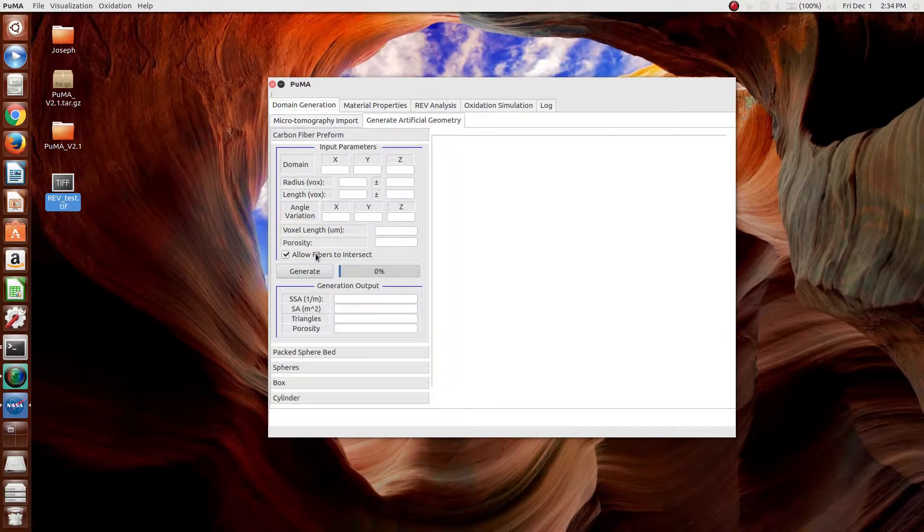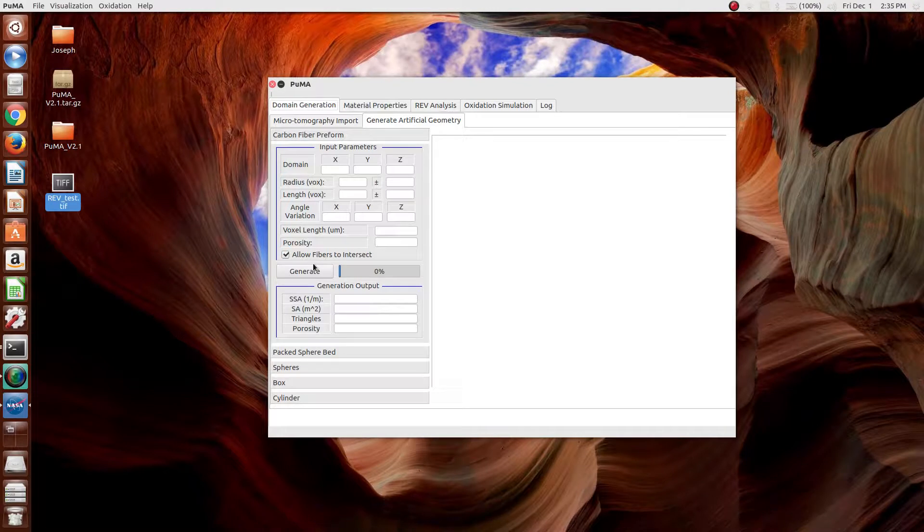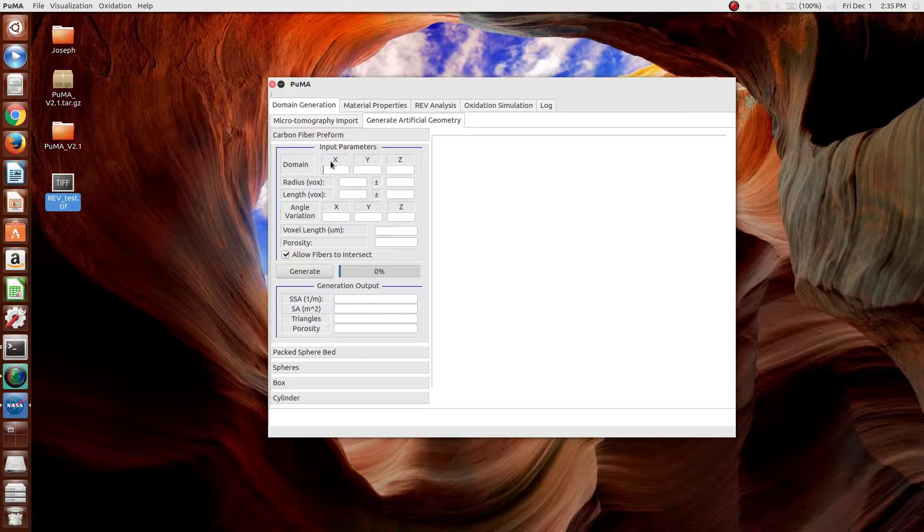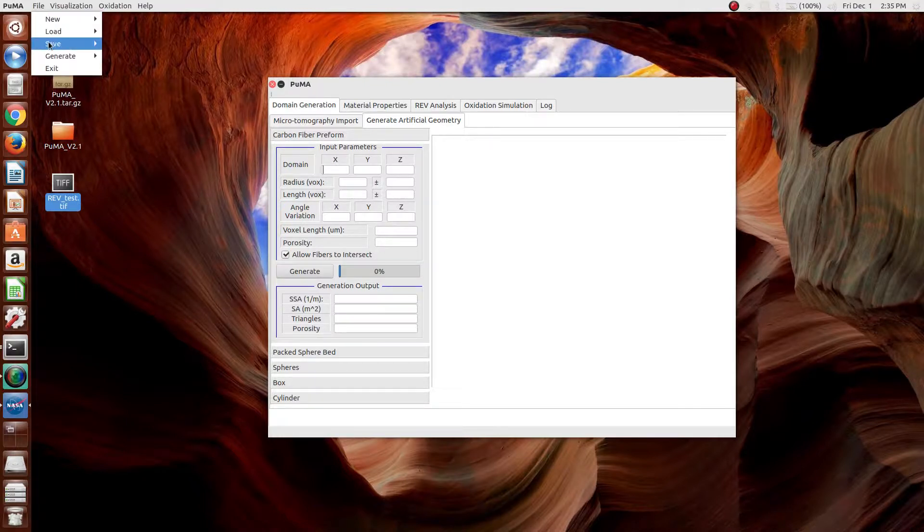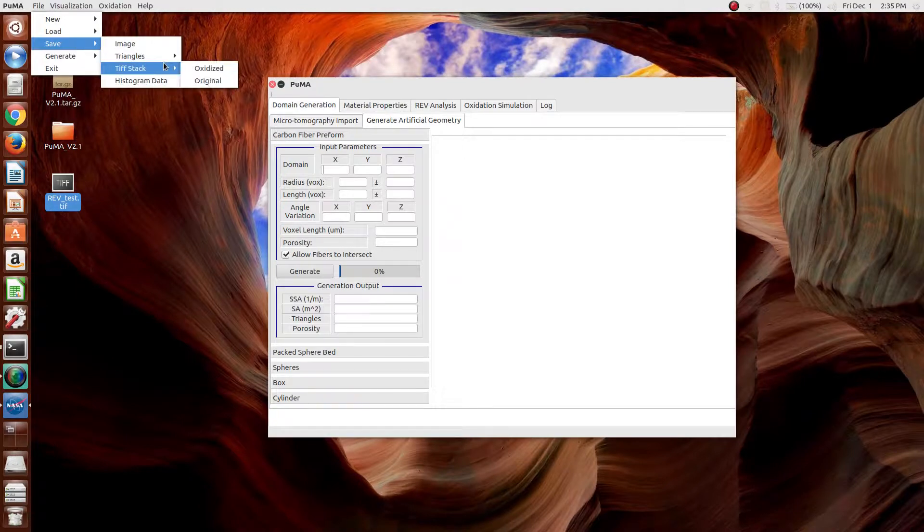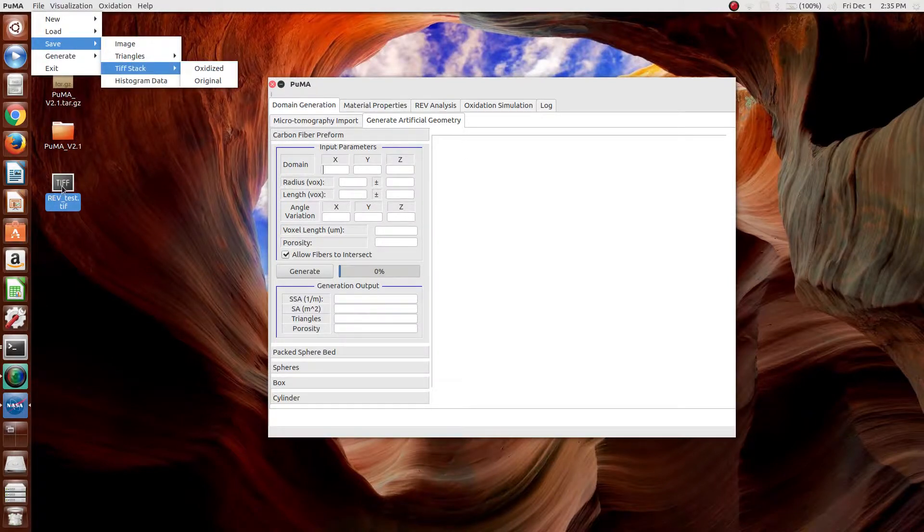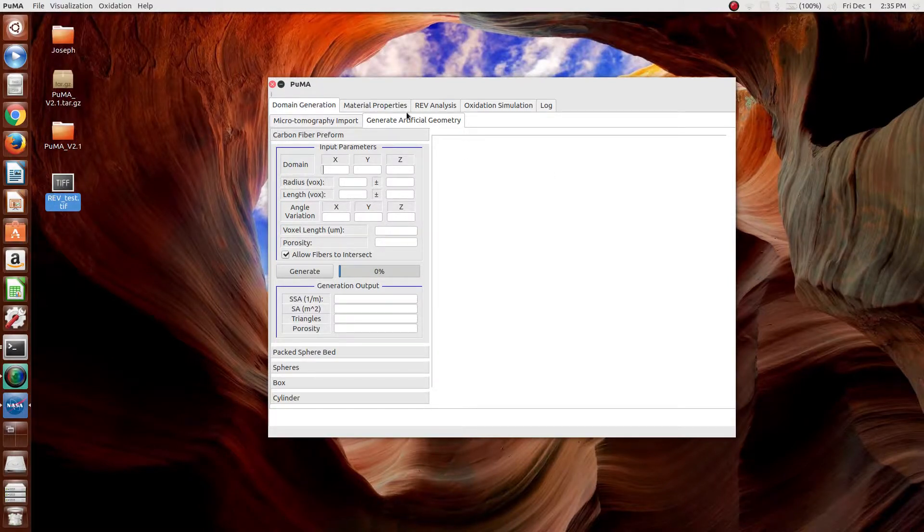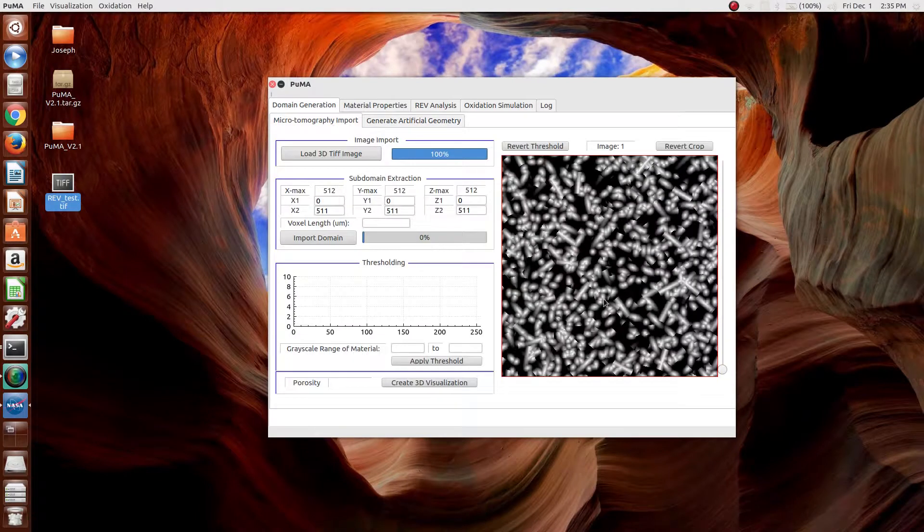If you want to use the REV analysis on an artificially generated geometry, the way to do that is to generate the artificial geometry, save it as a TIFF, saying File, Save, TIFF Stack, Original, and then import that into the microtomography import section.